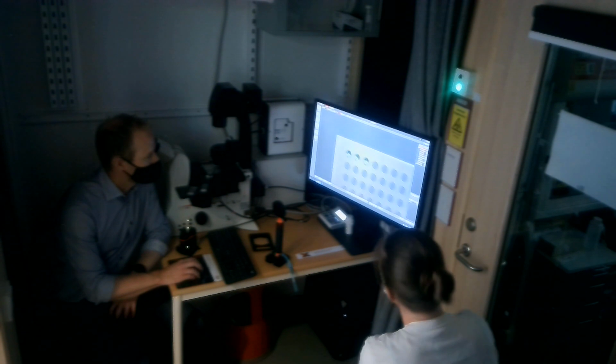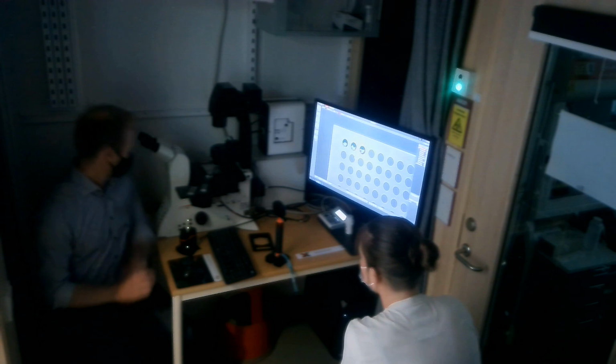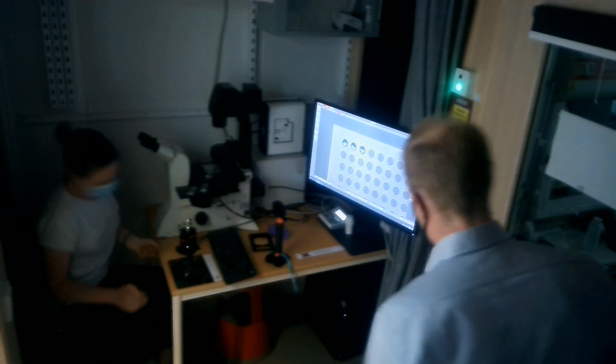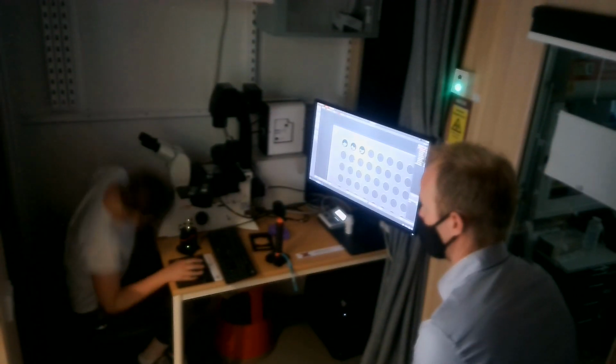Can we just have a quick look into D2? Yeah, sure. But we changed. Yeah. Oh, sorry. So you can, to a certain degree, use the template as it is, but you probably have to adjust it a little bit.